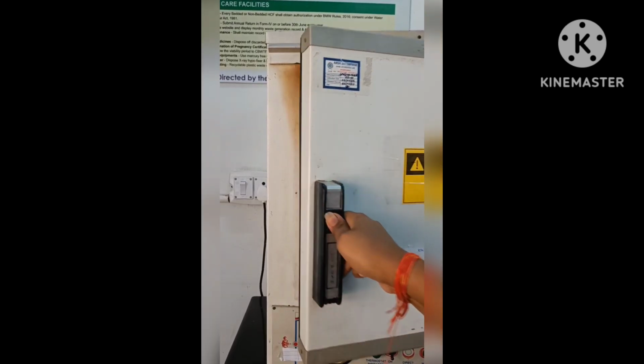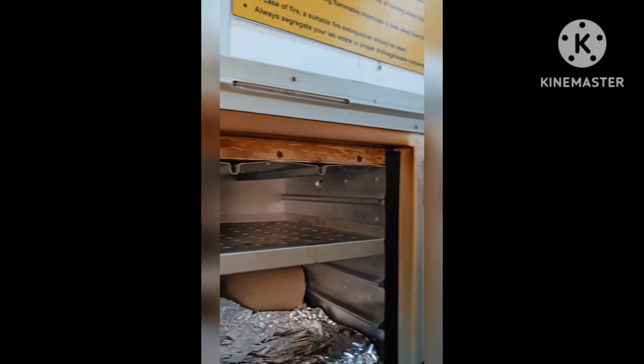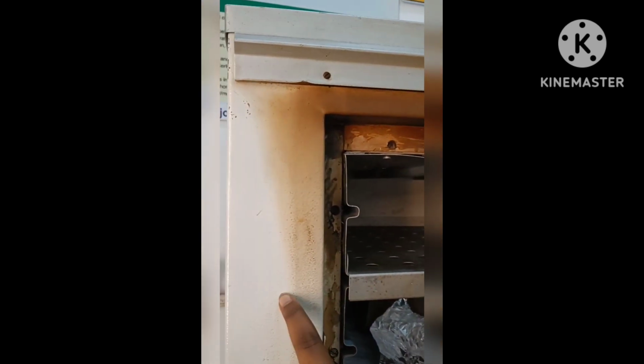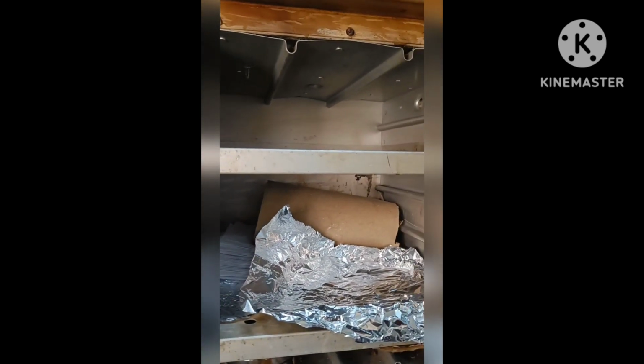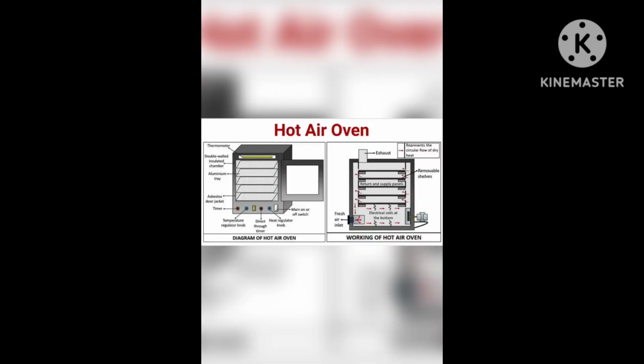Here we will be learning about the different mechanical parts of the instrument. The door: a single door on the side is fitted on heavy hinges. The presence of an asbestos door gasket on the side is used to decrease the heat loss during the operation. Coat and cabinet: the external shield is built of aluminum or stainless steel, which resists mechanical shocks and oxidation. It also insulates the internal.